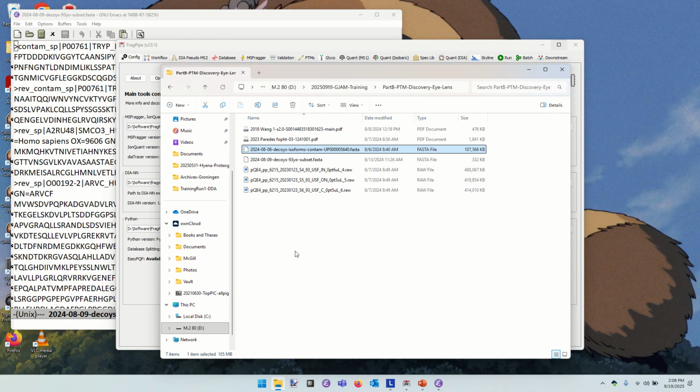We were discussing earlier that some of the workflows for FragPipe can export a protein.fas file, and that FAS file is a FASTA that contains just proteins for which some peptides have been identified. So it's a quick way to get a subset database that you can work with. In this case, we'll only care about modifications to proteins that could otherwise be identified, so it should cut out a lot of our search space.